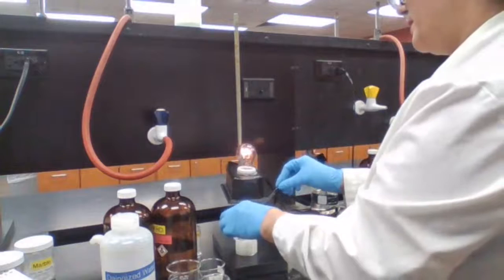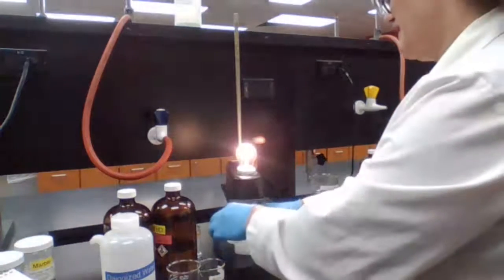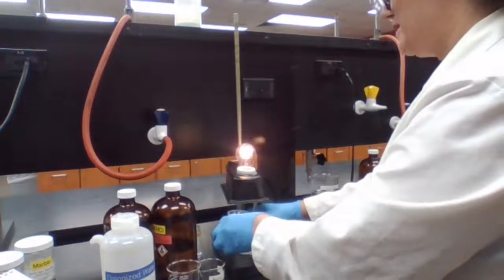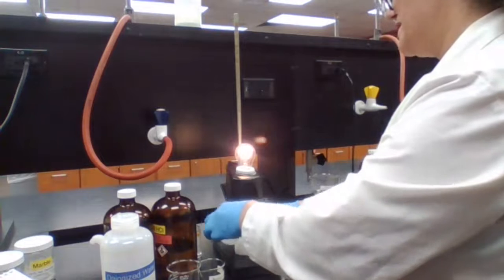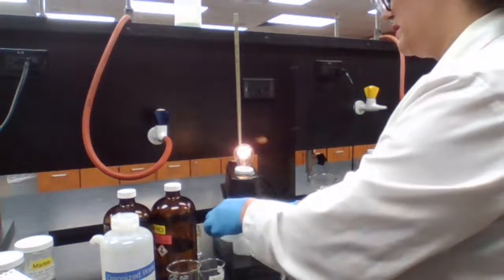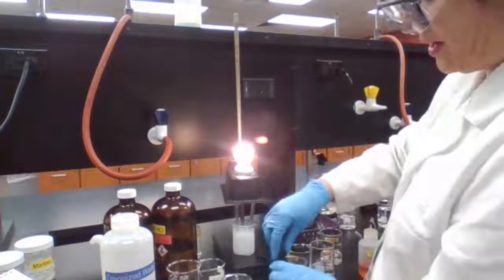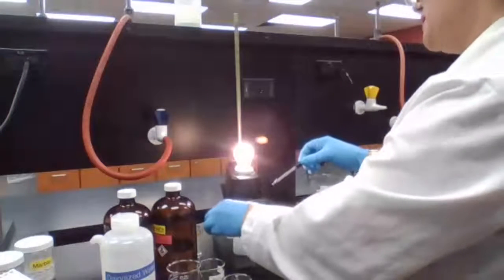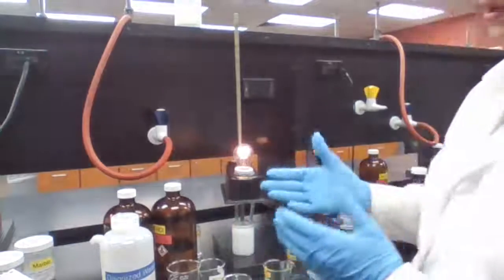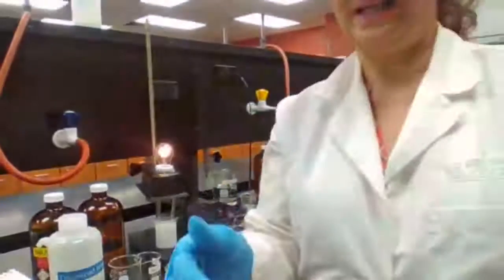It's going to turn off the light if I add enough of the two to reach the point of neutralization. So there is no leftover acid or base. If I have extra acid or extra base, obviously it's going to be an electrolyte. But if I add enough of each to neutralize both completely, there is no light and no electrolyte.